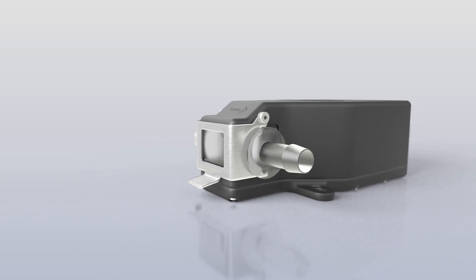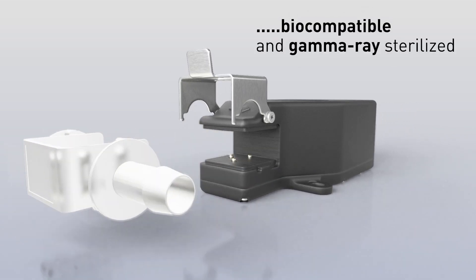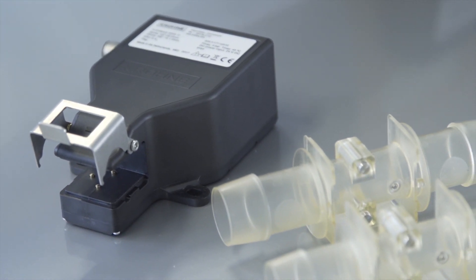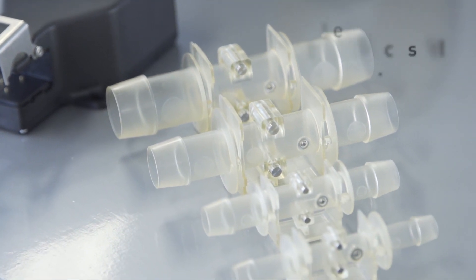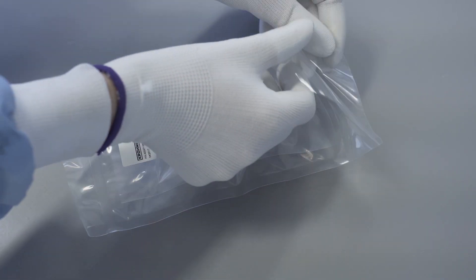From a hygienic perspective, the replaceable tubes are biocompatible and gamma-ray sterilized. It meets the biopharmaceutical requirements for adaptation to single-use systems. All wetted materials meet the USP Class 6 and ISO 10993 standards, and each tube is packed in a double-layered PA-PE pouch.